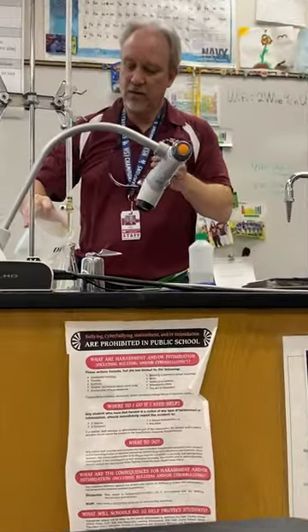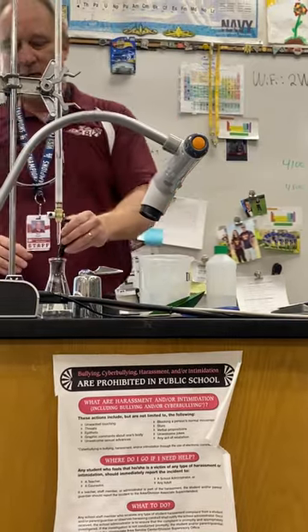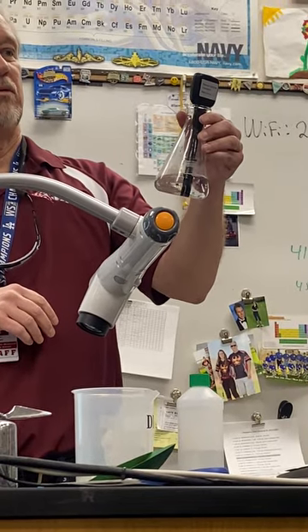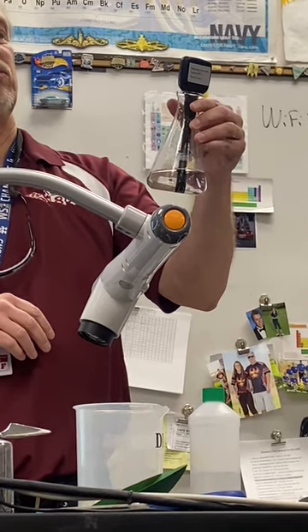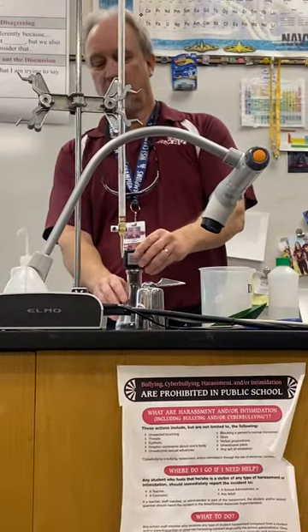Once you take it out of its buffer solution, try to get it back into liquid pretty quick, so don't do it till you're ready to go. And you can take an initial pH. So I'm getting around 4.2. So I would log 4.2. Make sure I know my starting amount here.